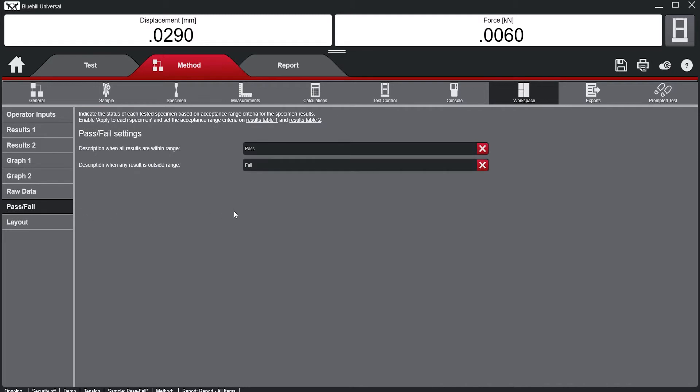Here the verbiage can be changed for either a Pass or Fail description. A Fail notification could alert the operator to seek the assistance of the lab manager.